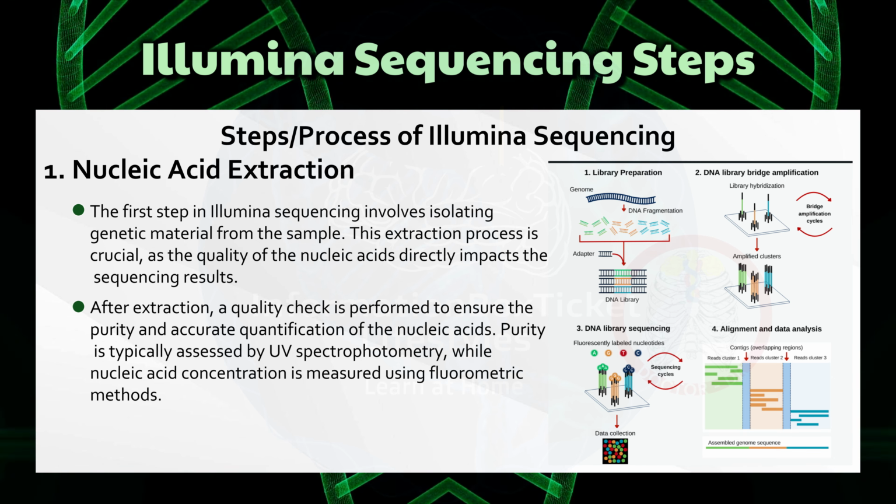Faces challenges with loss of synchrony during sequencing, as not all molecules in a cluster incorporate nucleotides simultaneously, potentially affecting accuracy. Risk of overclustering if too much DNA is loaded onto the flow cell, which can reduce sequencing quality and accuracy.